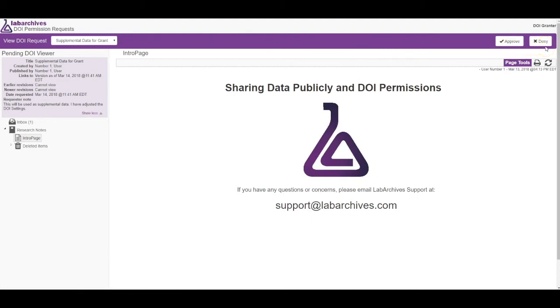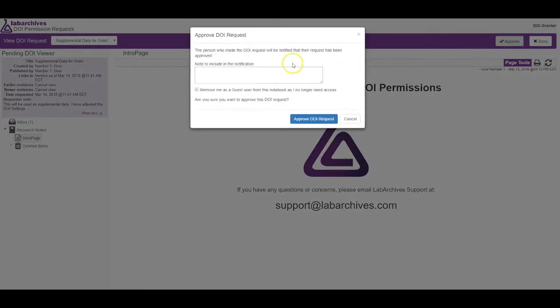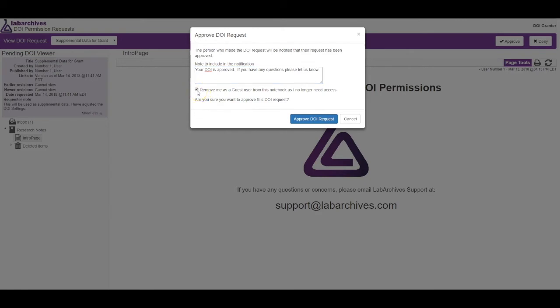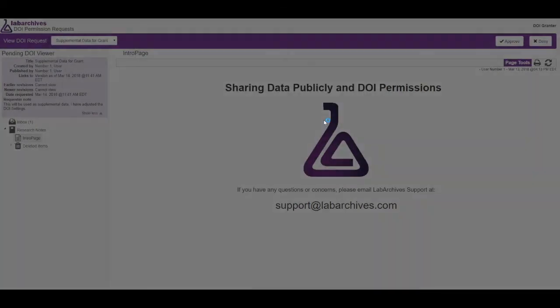If the DOI is approved, the DOI will be made. Either way, the DOI grantor can provide a note with comments and select if they would like to be removed as a guest from the notebook. Once they click Approve DOI, the DOI will be made.